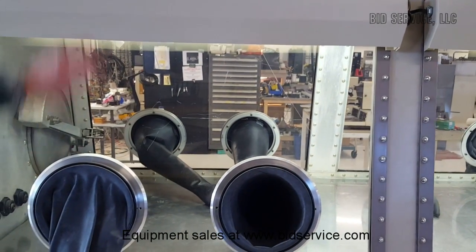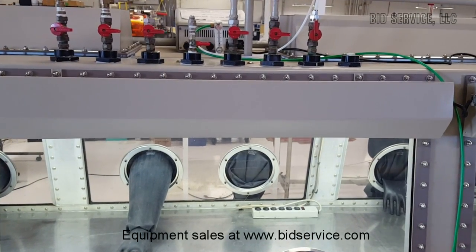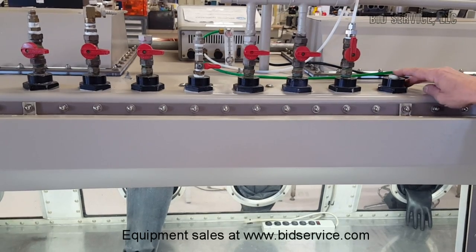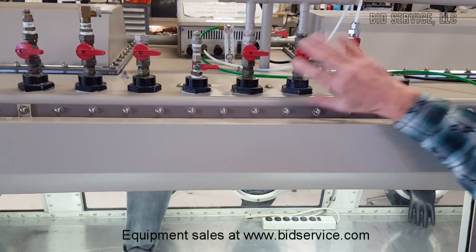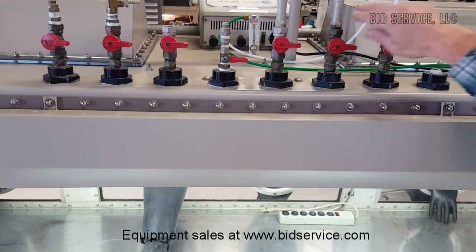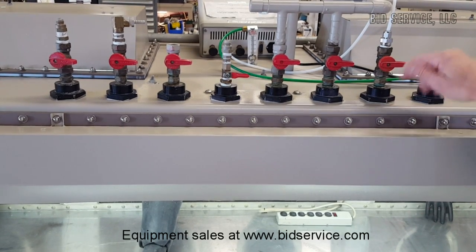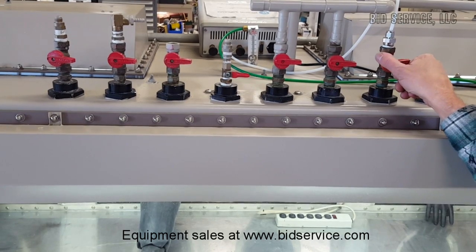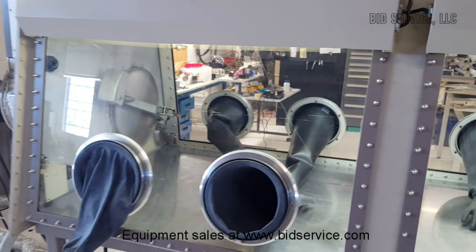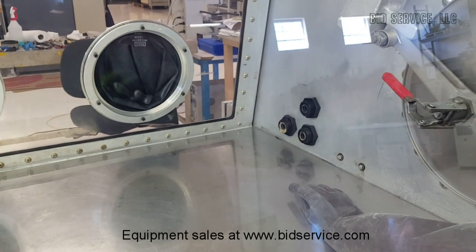These are additional valves that were here — you can always blank them off using a blank-off port right here. I just left these in place; they're not being used, other than this one valve feeding through our oxygen sensor, which is our house system and won't come with the system. These are basically on/off valves that allow you to introduce gas into the chamber wherever you're using your feedthroughs. There's an additional one on the side, and a couple of other ports inside that give you access to the inside of the chamber.